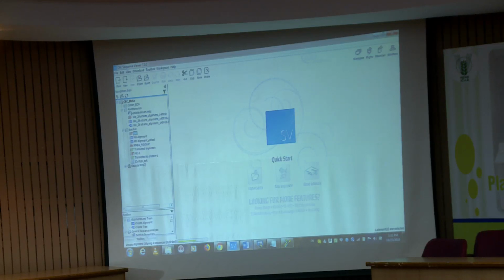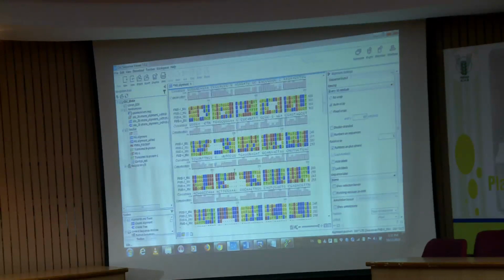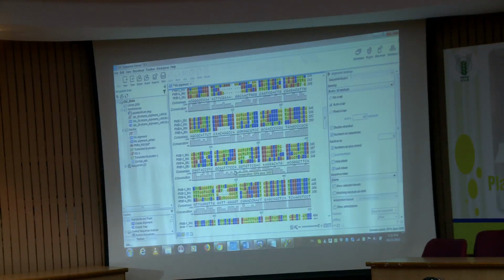So now you can see at the bottom it is making the alignment. So your files will be aligned somewhat like this, right? Because at some point data may not be good in some sequence, it may not read it correctly, it may not align. That is the reason it is showing some gaps somewhere, right? So there is not uniform data among all these 4 sequences. Now these are the 4 samples, all with one gene. So 4 samples data I have imported within a single text file.